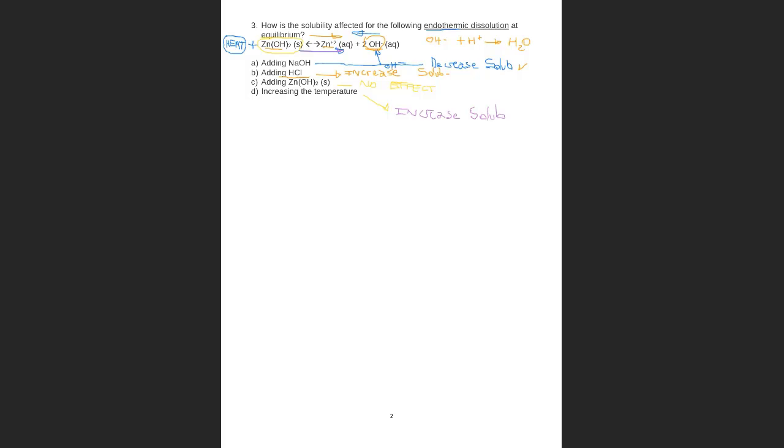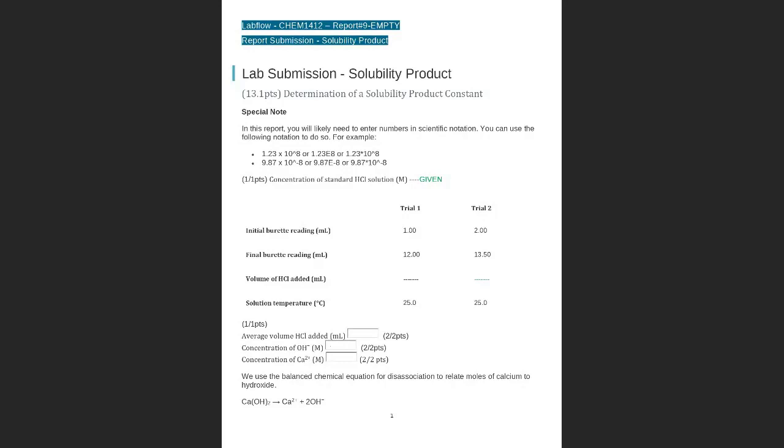Okay, then let me see if there is another. No, then we'll go to the report and make sure it's not that long, not a pain in the neck. I hope so, but that's an opinion, like we said before. So let's share the page of the empty report. You shouldn't do many calculations. There is a page that will have all the data, and I believe you can pick any data within that range. I pick this data, you can pick any data.